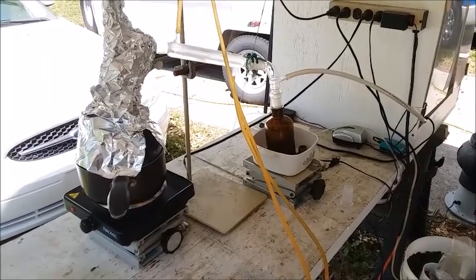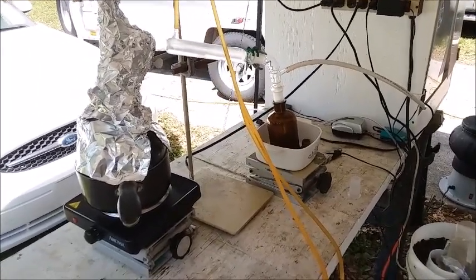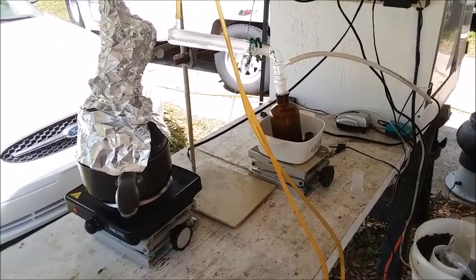Well hello YouTubers. I'm making another run of nitric acid, and I've made a few changes in the way I do it — dare I say improvements, even.